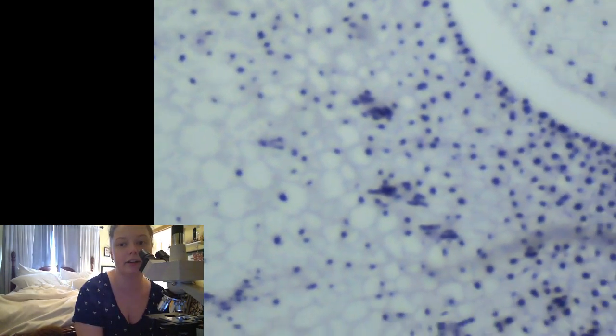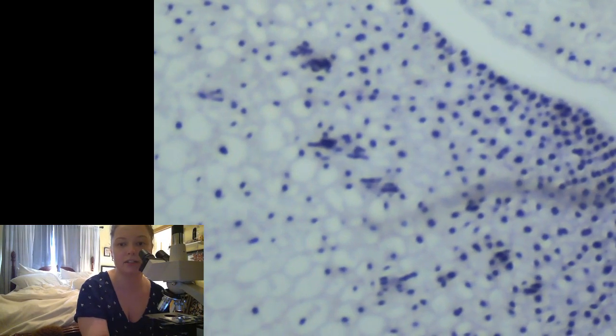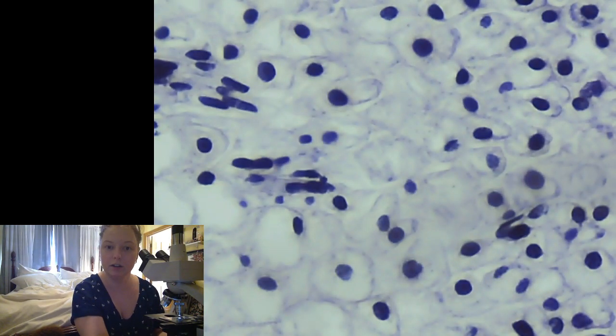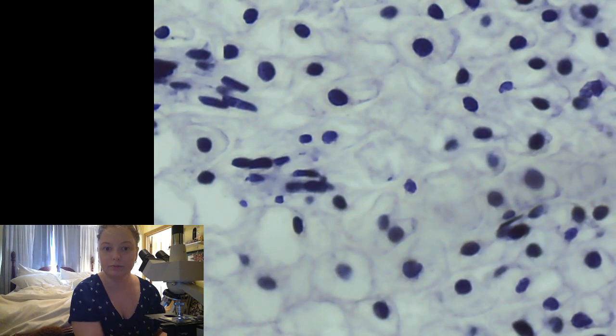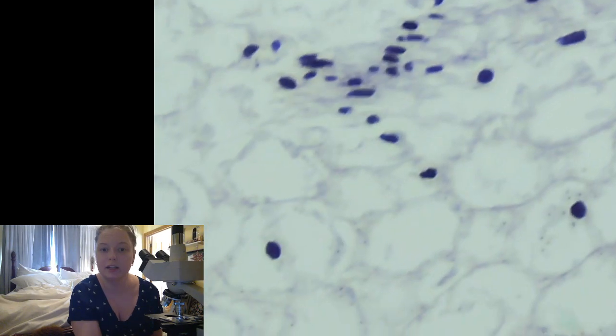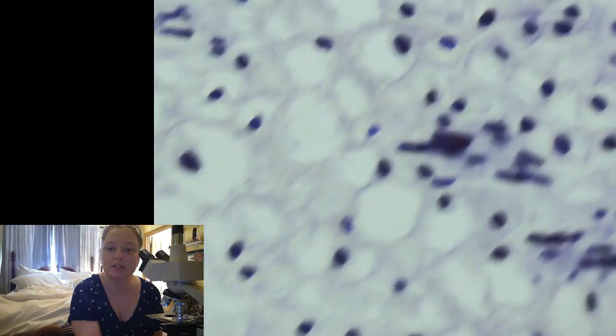Okay, so here we've got, these cells are doing meiosis, so they're going to look pretty similar to our mitosis slides. And we're going to see some of those chromosomes condensing. Zoom in a little more. So this slide's interesting. You really, even less so than the other one, can't see those stages we talk about, but you can really see those condensed chromosomes. You can see them.